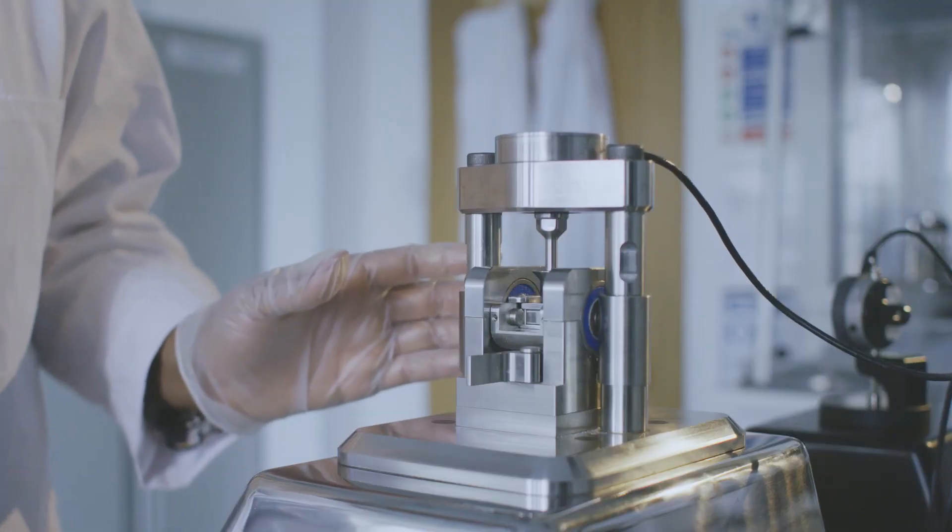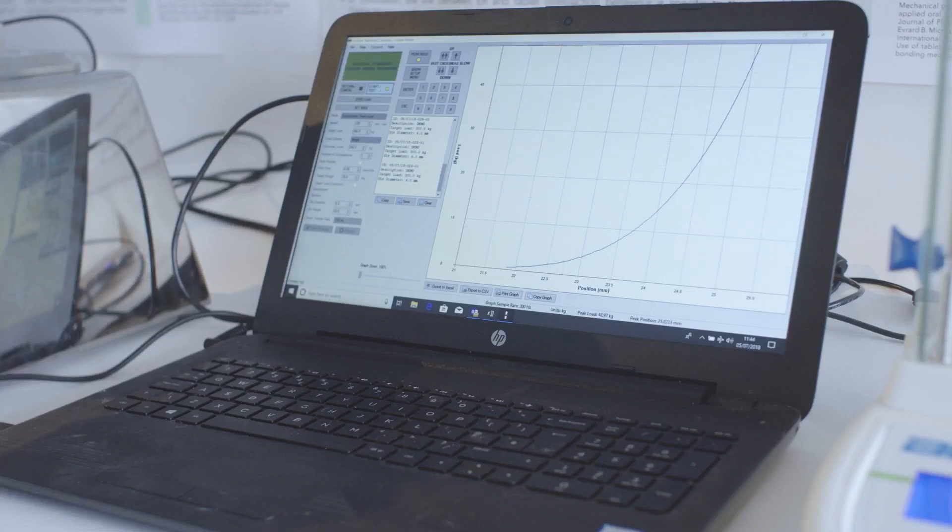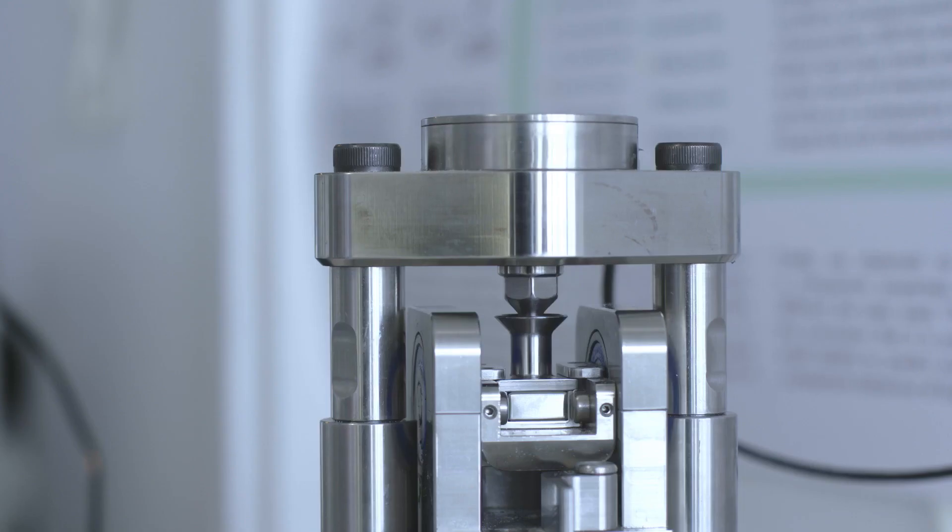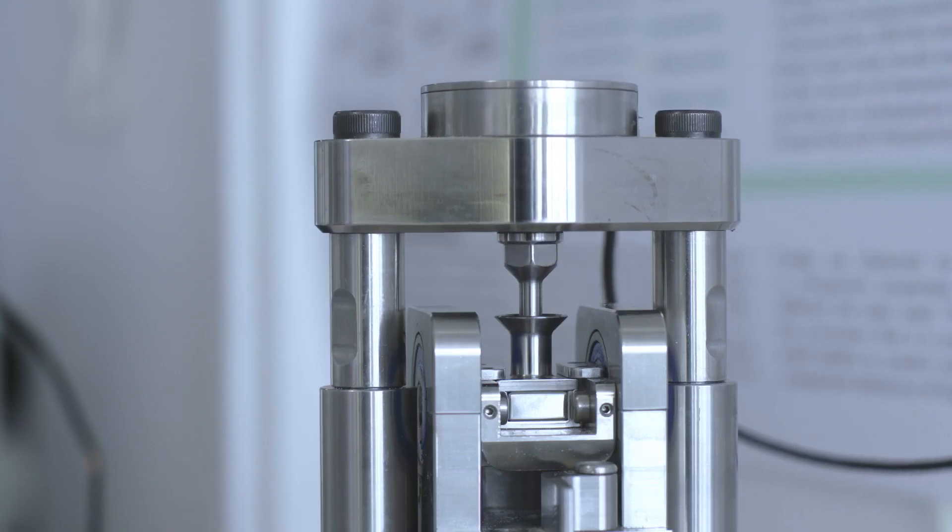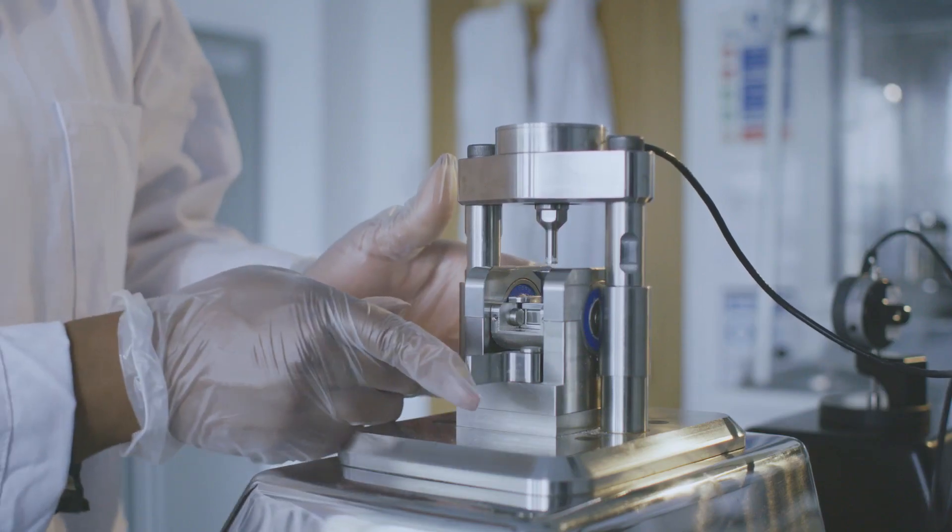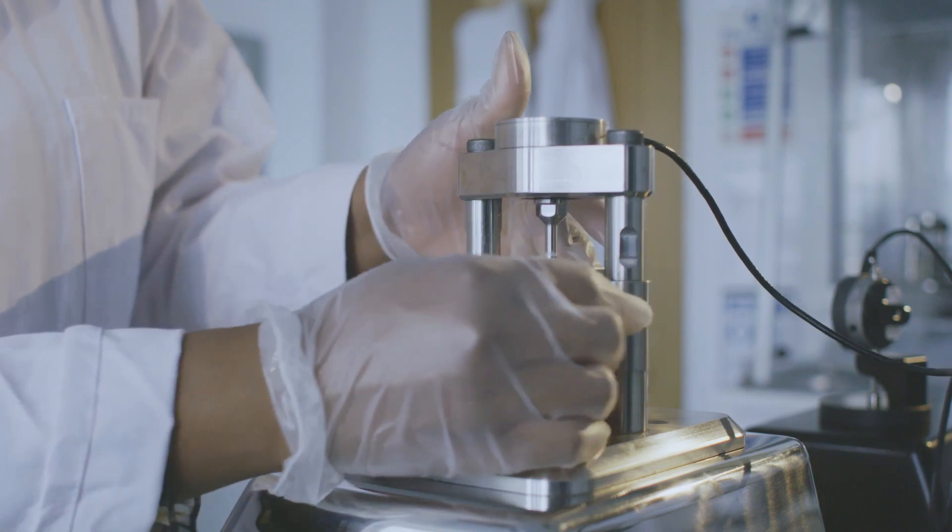The Gamlin system tests the compaction properties defined by the new USP1062 Tablet Compaction Characterization Monograph, as well as checking the lubrication and the elastic properties of the sample.